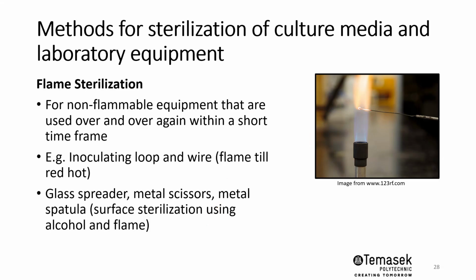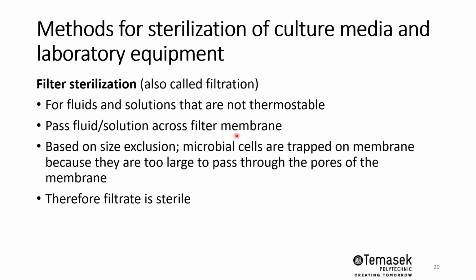So another method for sterilization is through filter sterilization, also known as filtration. So these are suitable for fluids and solutions that are not thermostable. So you can't use, for example, antibiotics. You place it or add it inside a liquid media, a nutrient agar media, and then subject it to autoclave. This will deactivate or even destroy the antibiotics, because antibiotics, we know, they are not thermostable. They are highly heat sensitive.